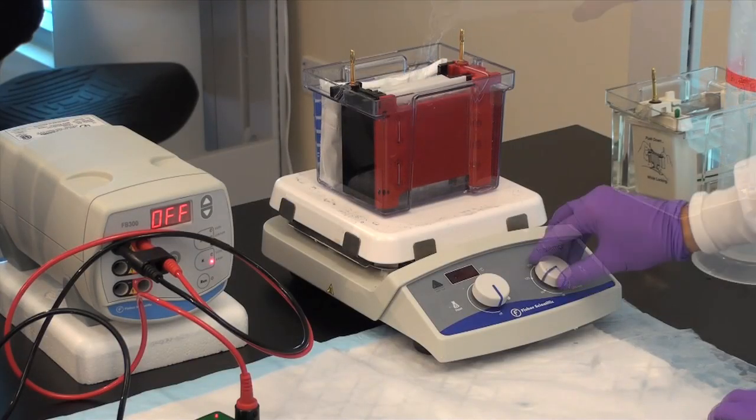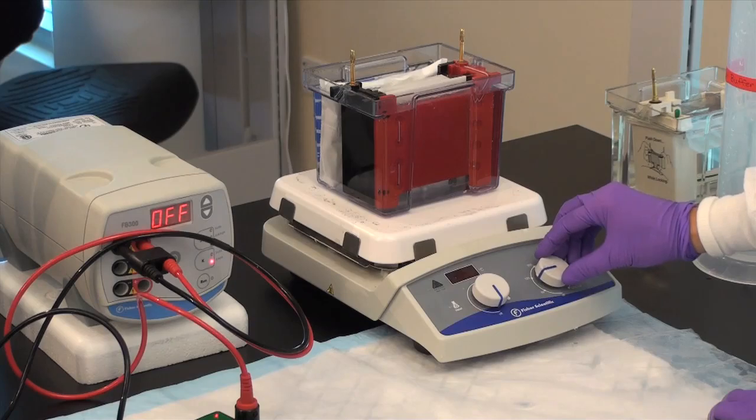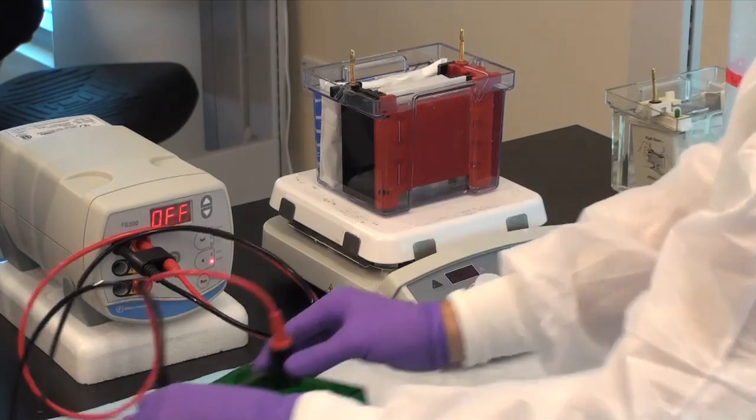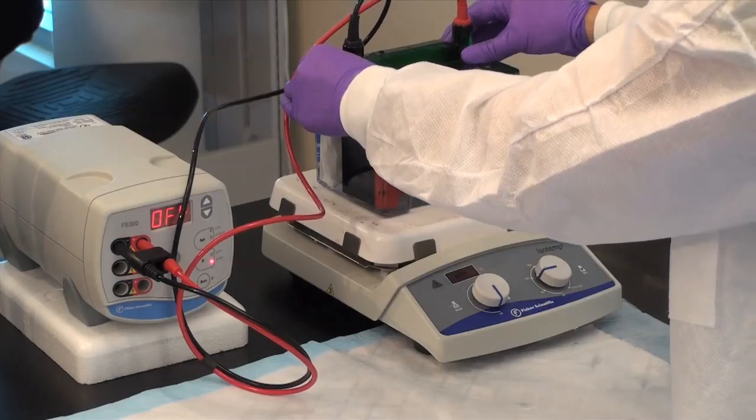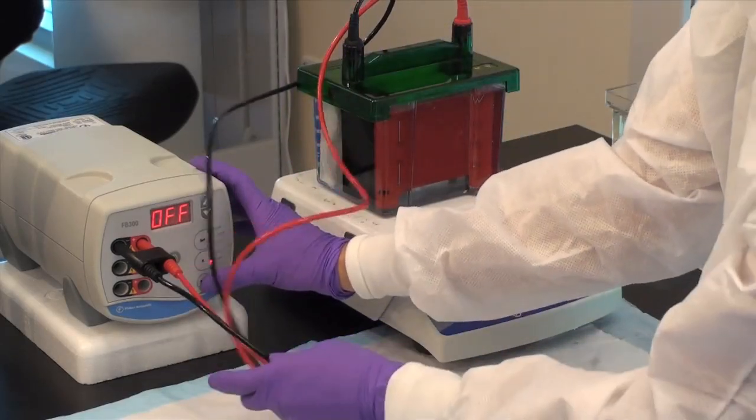Place the tank on a stir plate and set the stir feature to a low setting to circulate the buffer and keep it evenly cool throughout the transfer. Secure the top of the tank and turn on the power supply. The transfer should take about one to two hours.